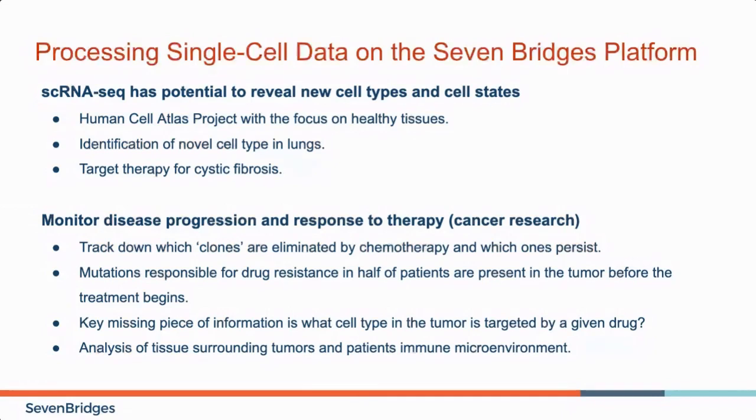All of these and many other questions can be answered using single-cell transcriptomics in combination with the bioinformatic tools we presented today, and cloud-oriented infrastructures like the Seven Bridges Platform could help manage increasing sizes of single-cell data sets and provide the environment to conduct reproducible bioinformatic analysis.